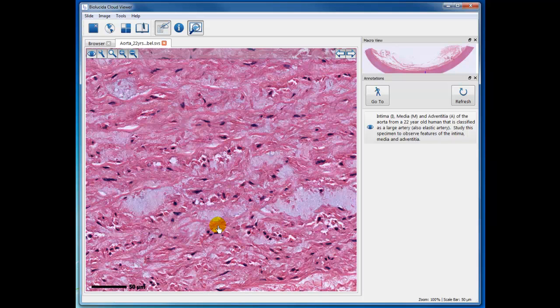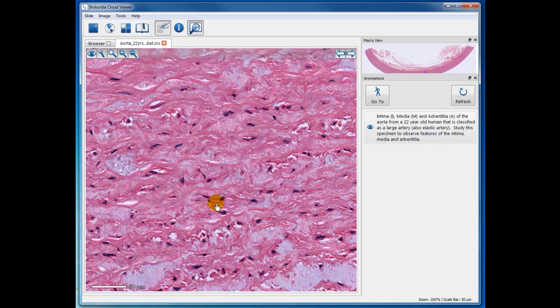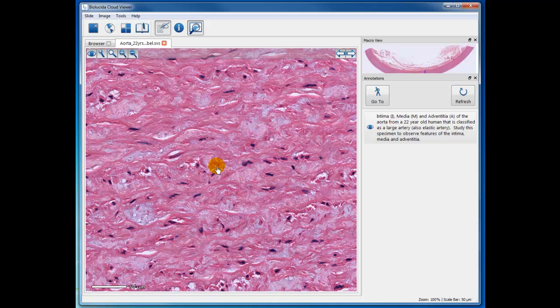So you have fibroblasts and mainly smooth muscle cells that are connected from one membrane to the other, and as the heart beats and the aorta expands and contracts, elasticity keeps the blood flow running fairly smooth, with pressures not dropping to 0 but ranging between 80 and 120 in the arteries. There's a lot of wear and tear on those elastic membranes, and that's what you're seeing here.